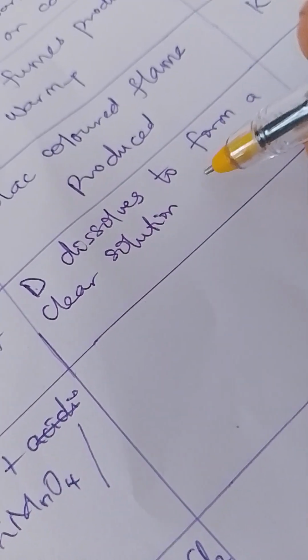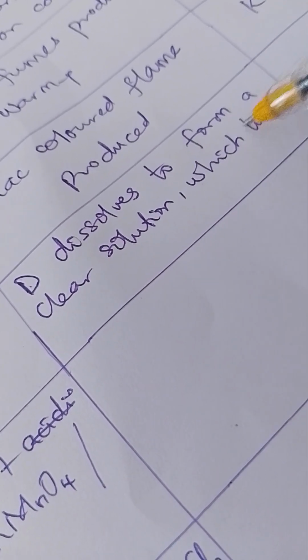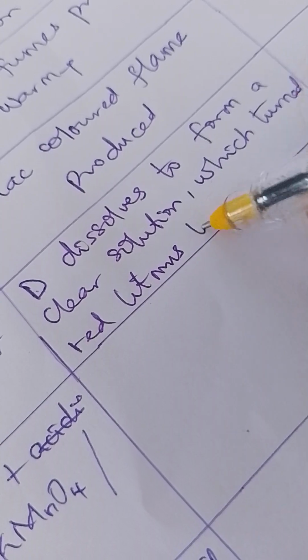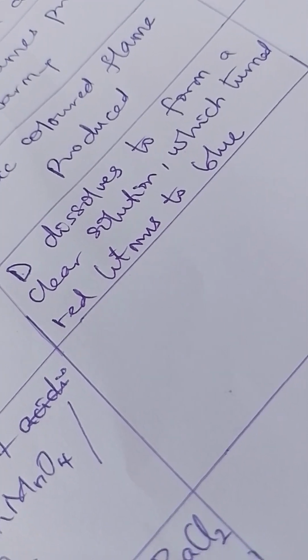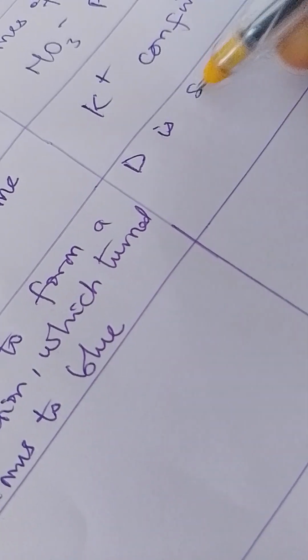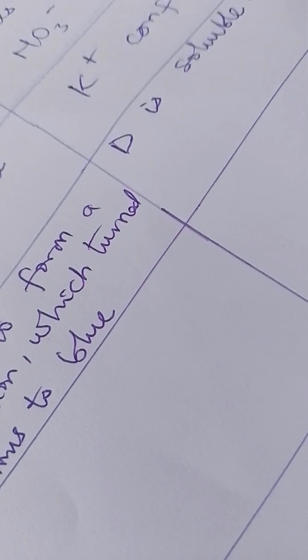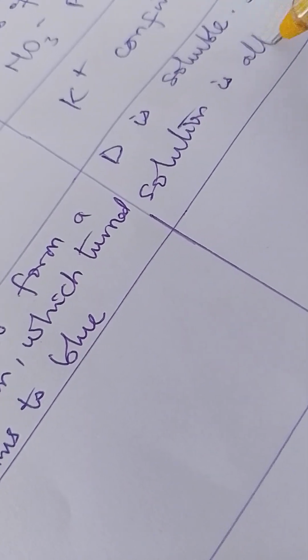And this solution, even if you are not told, try to test it with litmus paper. You discover that it turned red litmus paper to blue, and of course whatever turns red litmus paper to blue is alkaline, or you can say basic, but I would like to use the word alkaline. So what would I have as my inference? I'll say D is soluble, comma, its solution, that is the solution of D, is alkaline.